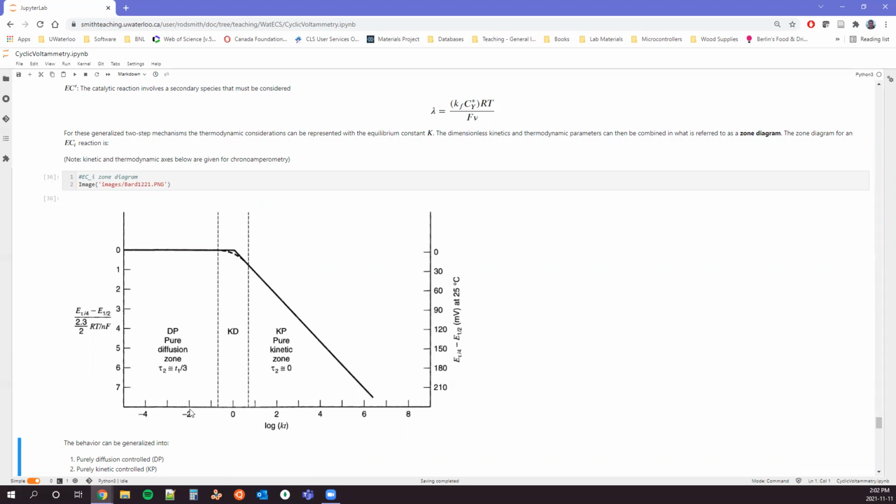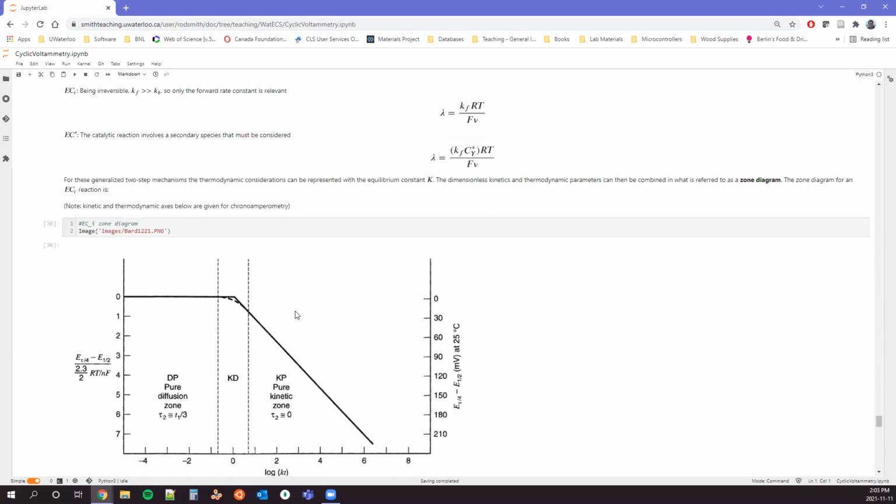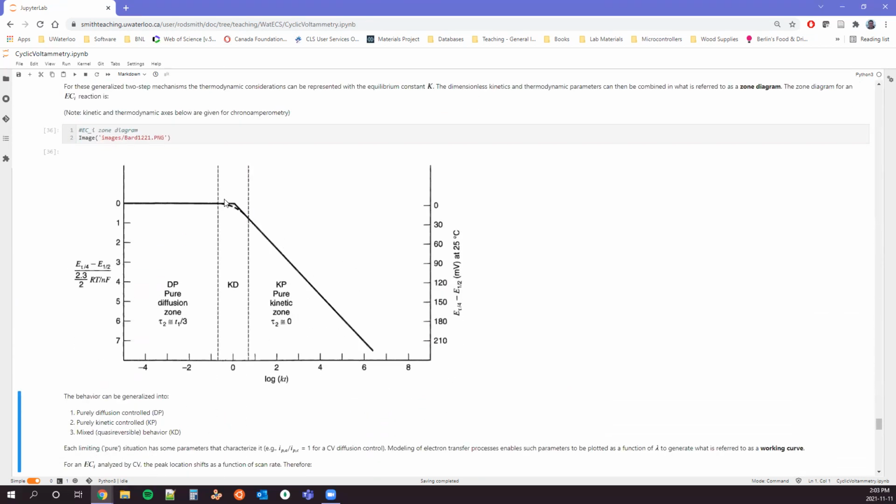And what we have is our reversible situation, pure diffusion on the left, right? And so when we scan really fast, we see that we have a purely diffusion based response. When we scan really slow, we have completely irreversible. And so that's over on this far right side. Then we have this transition zone in the middle, which is our quasi-reversible center, right? So it has some contribution from mass transfer, some contribution from kinetics.